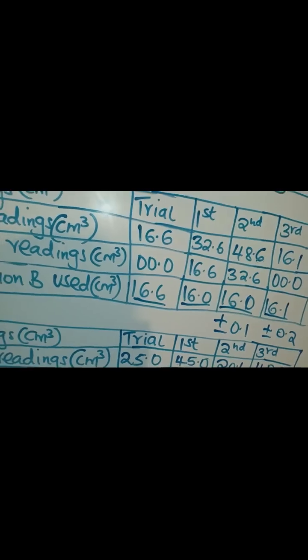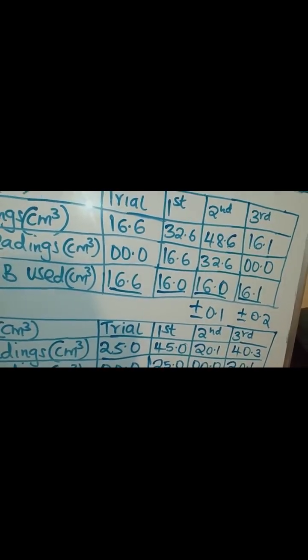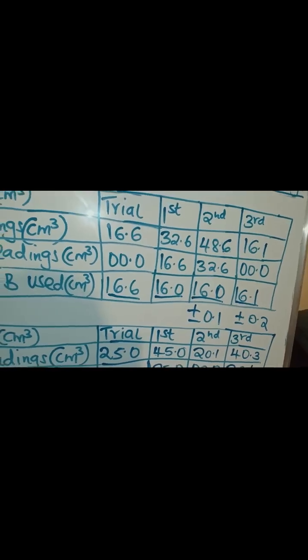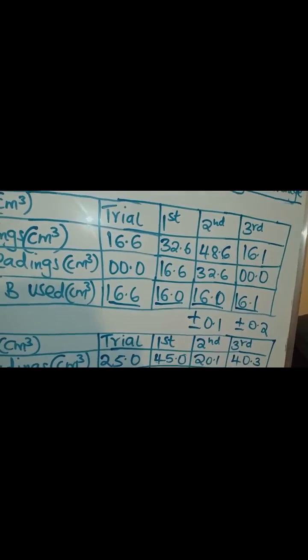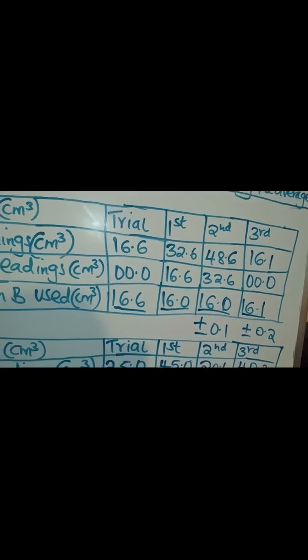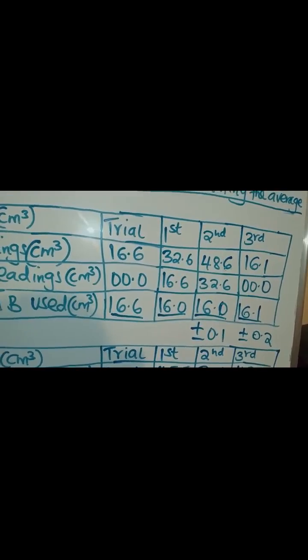So that is the difference that should be there. That is to mean from the biggest value to the smallest, and if there are other values in between, from one value to the next, you are supposed to do subtraction.